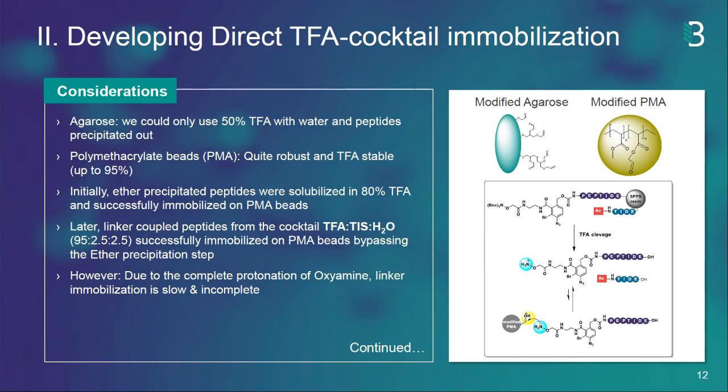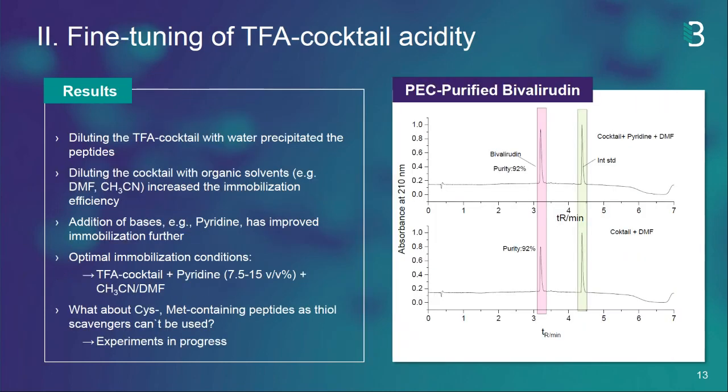So then we thought, can we fine-tune the TFA cocktail by adding water, or by diluting with acids, or diluting with bases, or diluting with organic solvents? Then we tried different conditions. We initially tried to dilute with water. Then we later realized that if you dilute the cocktail with water, even the peptide will be precipitated out, crashed out. So using water is out. It's not a good idea.